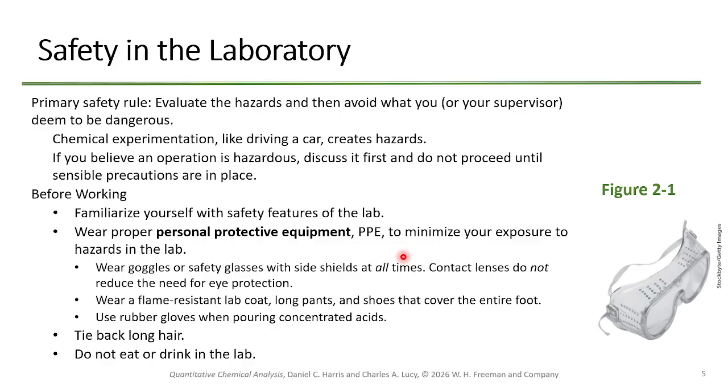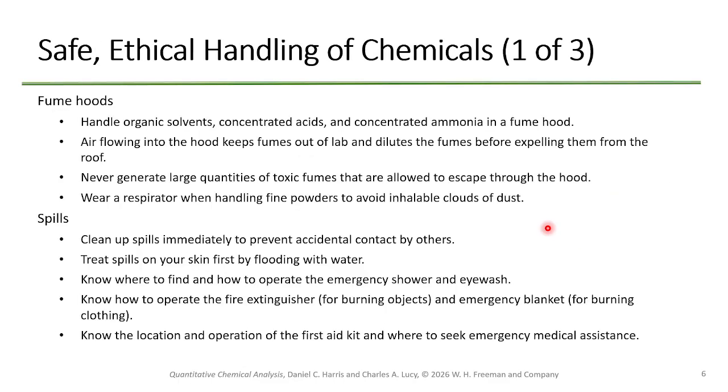Now, having said that, technically, you could probably get away with those little shields they give you, but I would prefer not. They don't work quite as well as actual splash goggles. They're like 90% there, but not quite. Also, those green and clear ones are not actually splash goggles, but they're again like 90% of the way there. But they have a gap right here, meaning if somebody actually does splash you in the face with something, it's going in on your eyes. Okay. Does anybody have any questions about any of this?